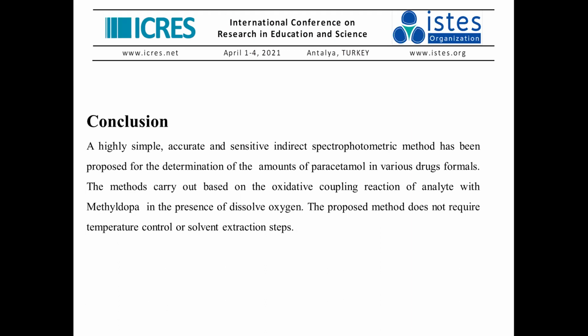And also our method is based on the oxidative coupling reaction, which is a very simple reaction with methyl dopa, which is also a drug used for high blood pressure, in the presence of dissolved oxygen, which means we don't need any oxidizing agent, which is almost always a very toxic chemical compound. In our experiment, we use the oxygen that has been dissolved in water to oxidize our compound.